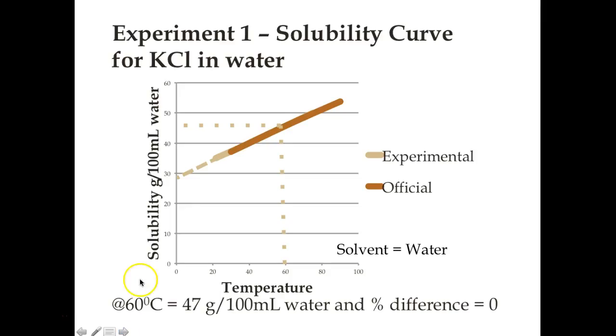When you do the plot, solubility goes on the y-axis, temperature on the x-axis. When you're using the graphical function in Late Night Labs, it automatically does the trend line, especially if you click on trend line, and then you only see one line. You may not see the separated lines like I have here, because they condense into one line, superimposed one on top of the other.